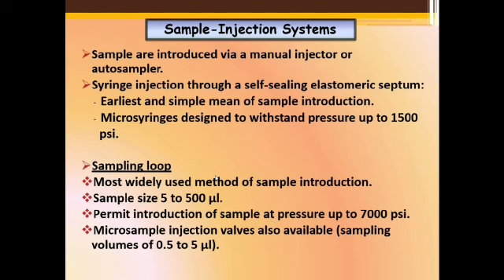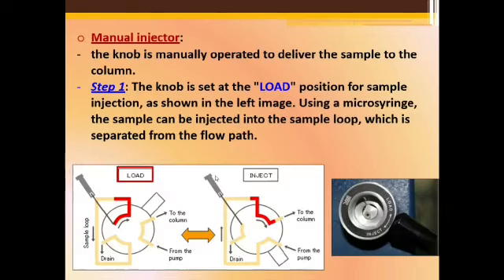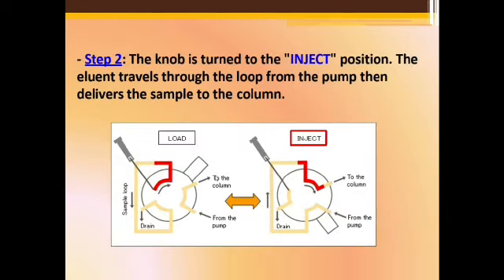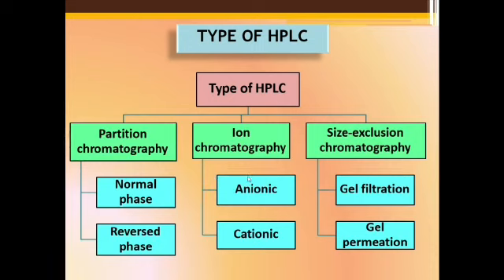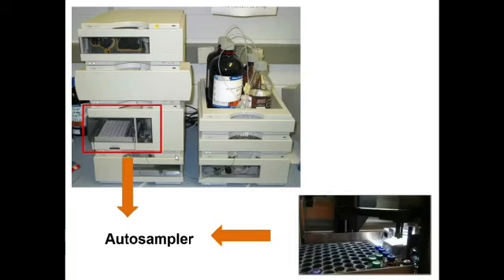So you are going deeper during your degree. All these things you can read. Okay, types of HPLC, much more: partition chromatography, ion chromatography, size exclusion, as your knowledge. It says as your knowledge. Maybe the question only asks for the type, how many types of HPLC, let's say like that. But all the processes you can see in your degree level.